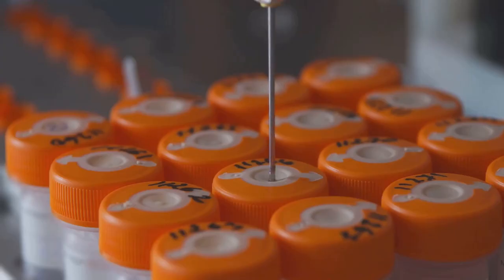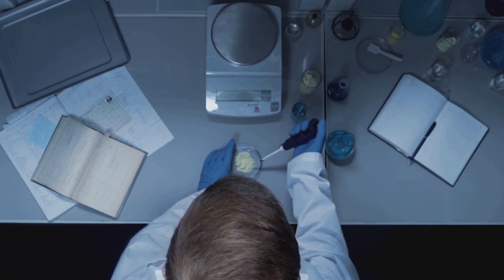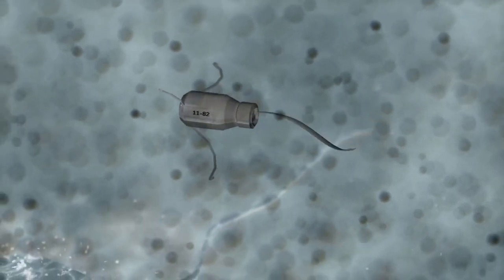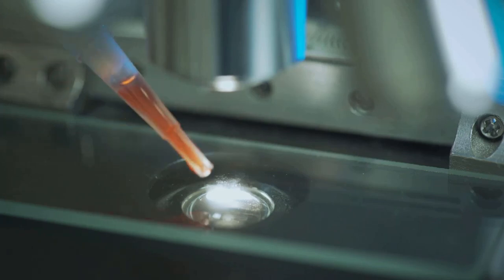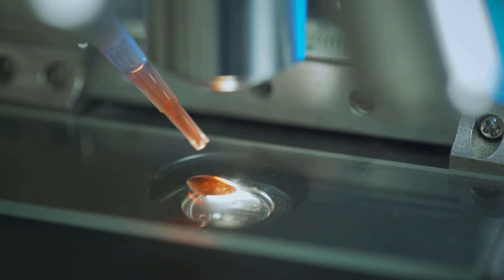Microfluidics is like a high-tech bouncer at the world's tiniest nightclub for cells. It checks each cell's credentials as they arrive. Some are VIP tumor cells, some are regulars, and some are turned away at the door. No pushing or shoving here. Everyone gets neatly sorted and goes exactly where they're supposed to. It's like watching a microscopic version of a TSA line at the airport, where cells are scanned, sorted, and sent on their way.